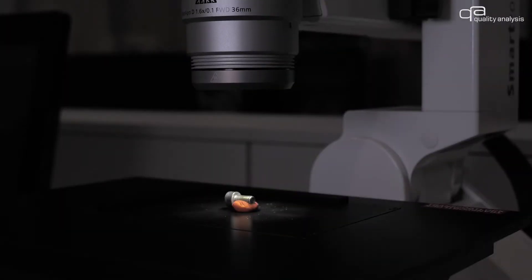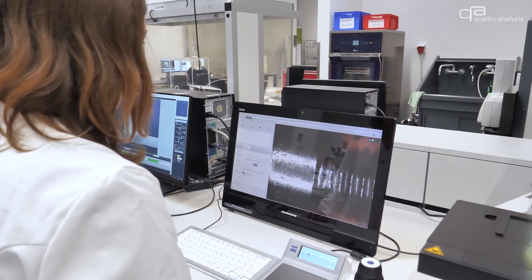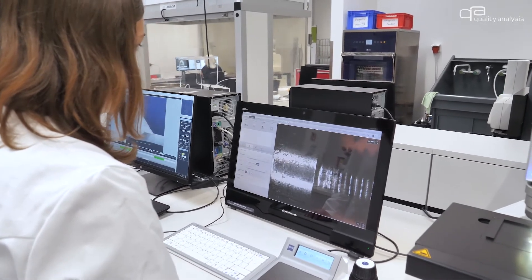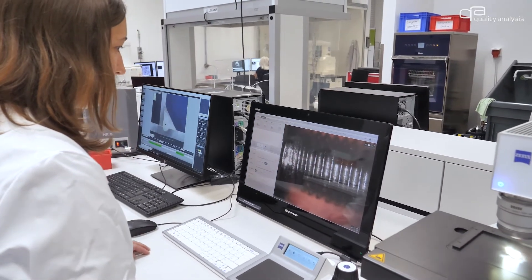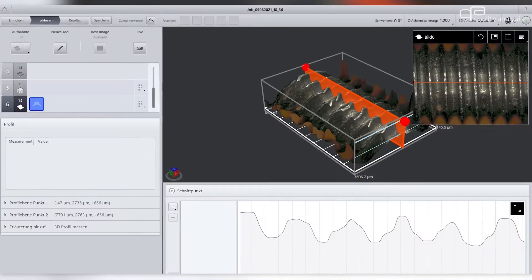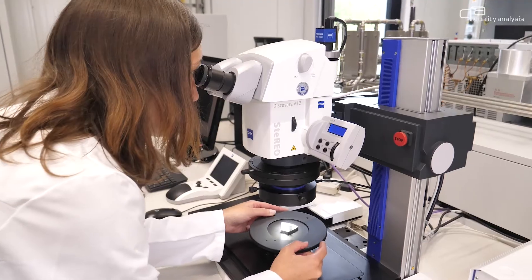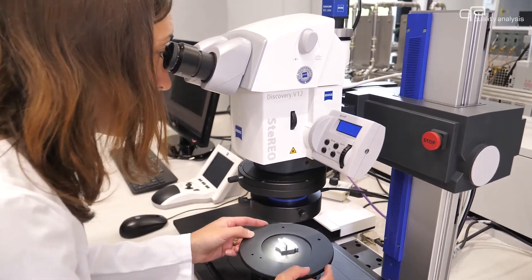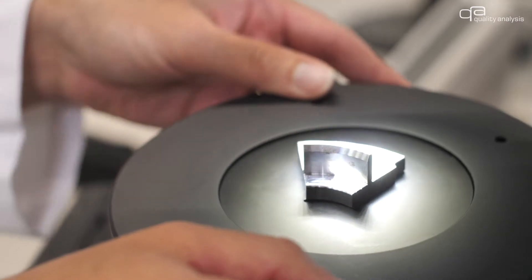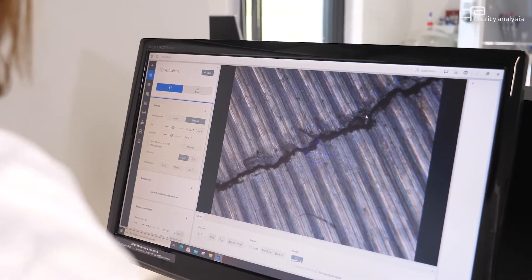Digital microscopy is applied for the multi-dimensional measurement of components, such as wear tests on friction surfaces. Stereo microscopy allows macro and micro examinations of grinding surfaces and fracture surfaces.